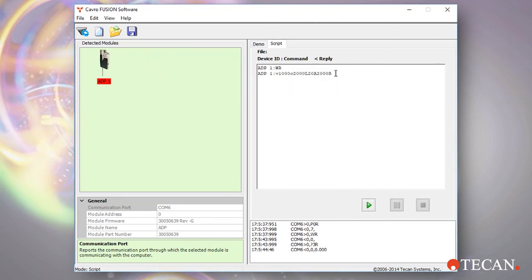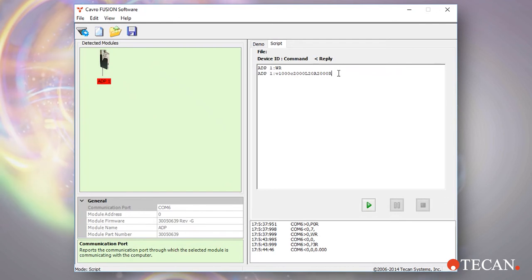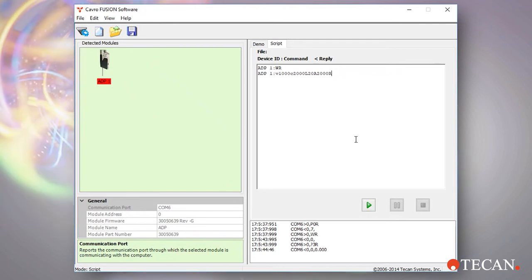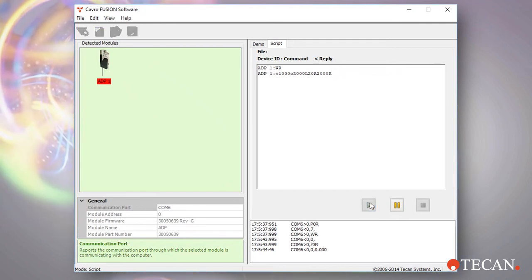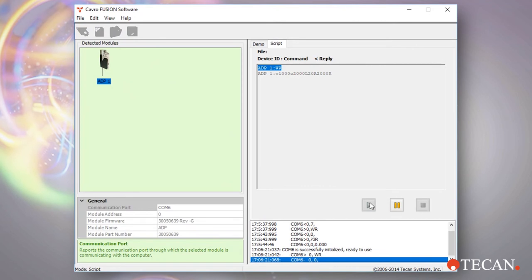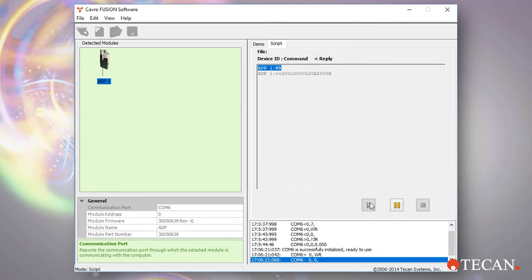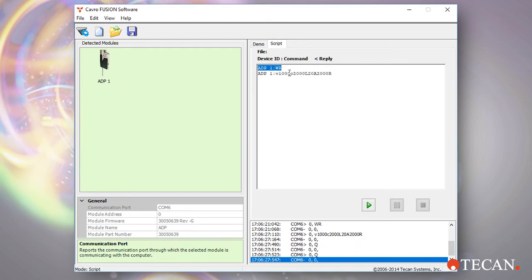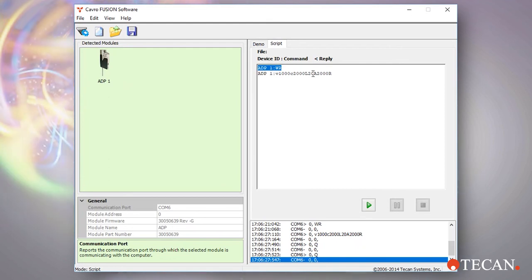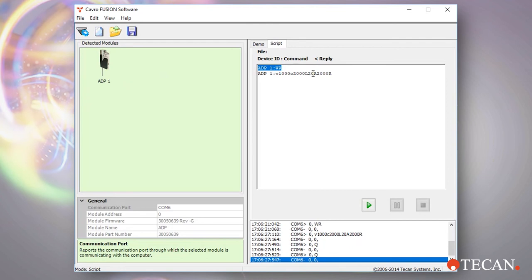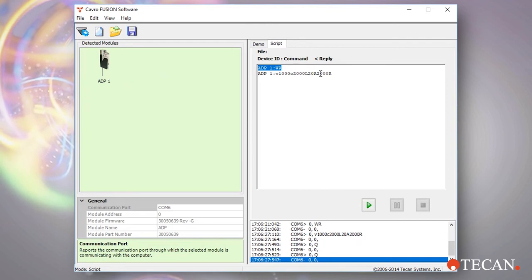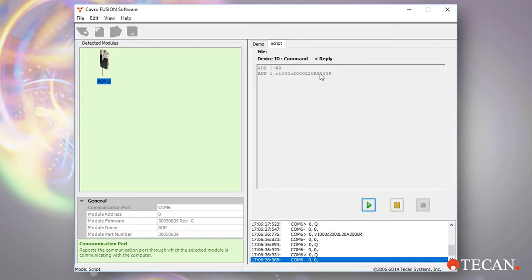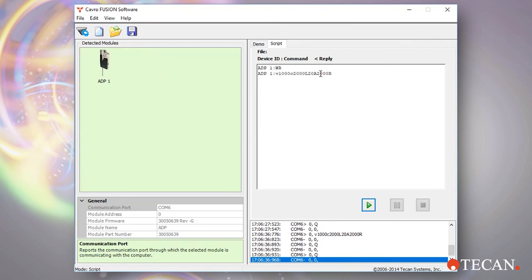There are a few ways to execute commands and command strings in Fusion software. Selecting the green play button will execute all lines in the scripting window from top to bottom. Highlighting or selecting one or more lines with your mouse, followed by the green play button, will execute just those commands. Finally, double clicking on a single line will execute just that line.